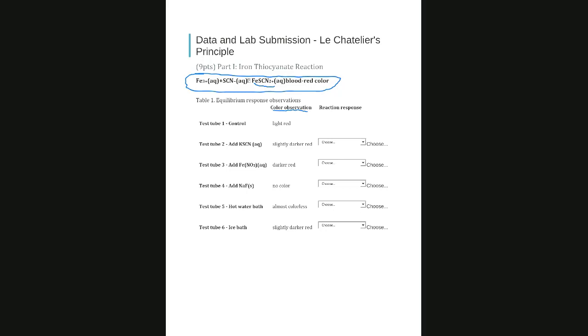Tube 1 we are not going to disturb, because we want to compare the color of tubes 2 to 6 to tube 1. If the reaction shifts toward the reactants, it will have one color, and if it shifts toward the products, a different color, so you will know in which direction the system shifts when you disturb it.